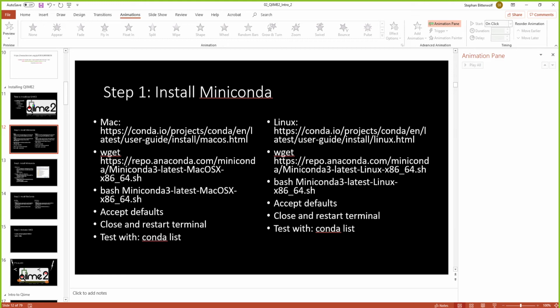Okay. If I have Miniconda, do I still need wget? Yes. Or do I have it already? I think with Miniconda you should be able to install wget fairly easily. Okay. But let's just all get to the Miniconda step and then we can all go together from there because it's the same for everyone. Sounds good.